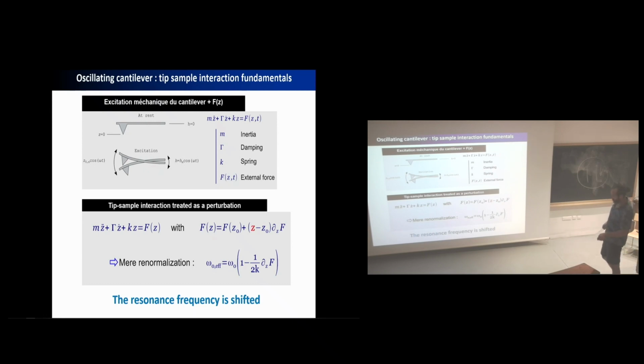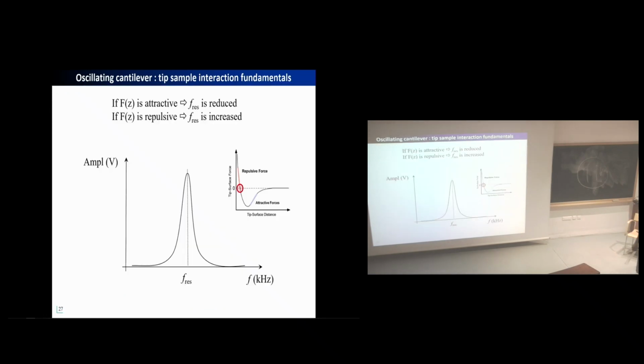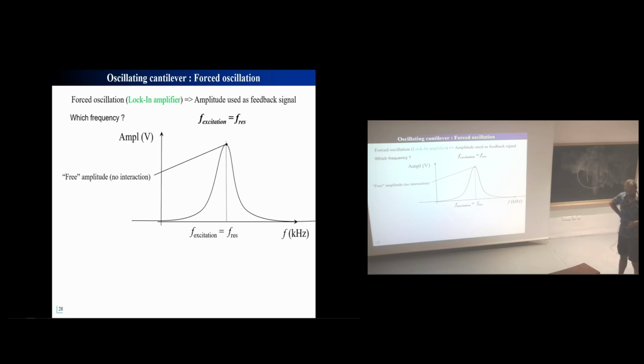And finally, you find that the resonance frequency is shifted. When the tip feels a force, the cantilever resonance frequency is shifted. So if the force is attractive, the resonance frequency is reduced. If the force is repulsive, the resonance frequency is increased. Simple.